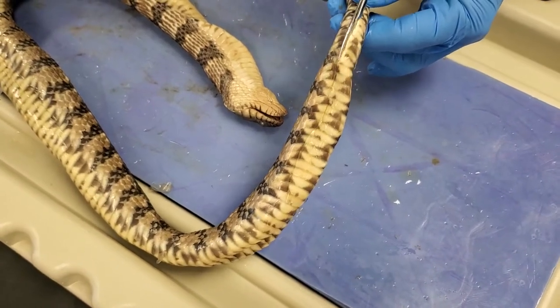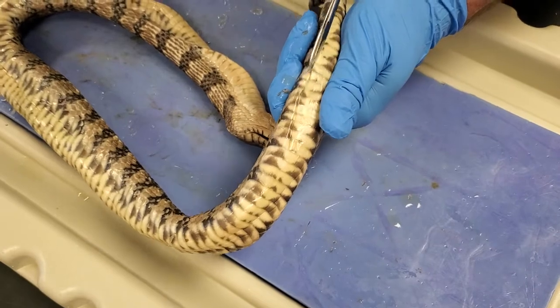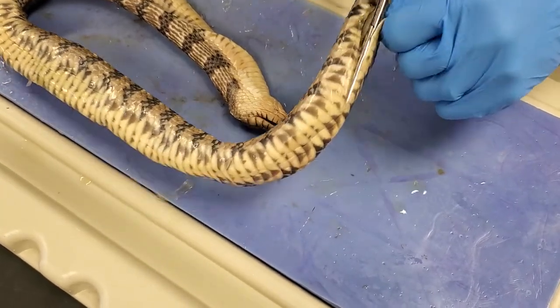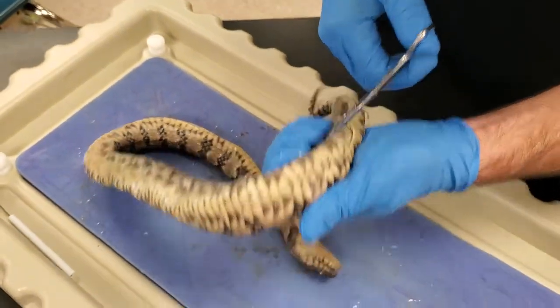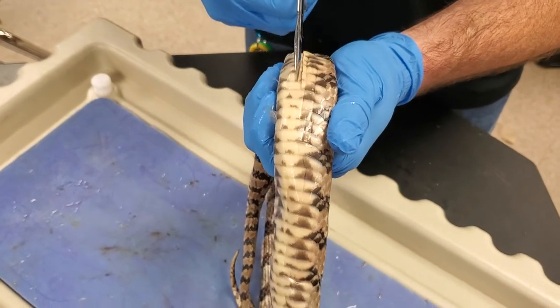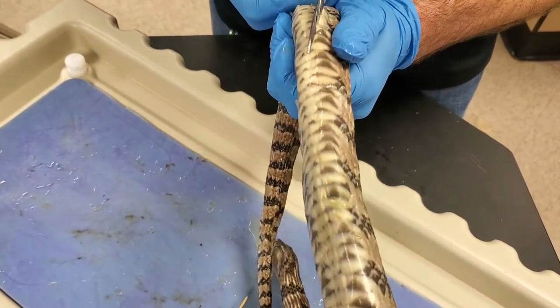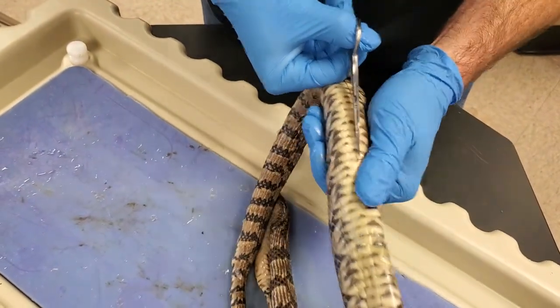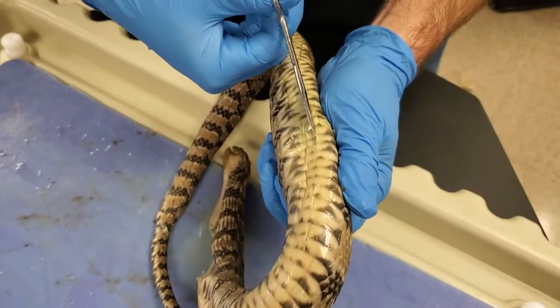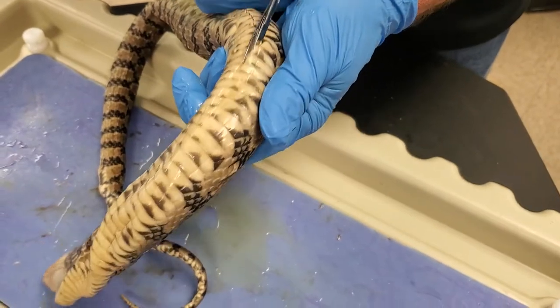So stick that scissor in and we'll start going. Got to be careful — back up every time I hit a little snag, then try again. Probably gonna have some juice coming out of this thing pretty shortly too, trying to stay as shallow as possible. Scissors are the better utensil here rather than a scalpel because these scales are pretty tough, and scalpels cut more deeply as well. These scissors end up being a much better idea for many types of dissections. Kids always want to get their hands on a scalpel, but scissors really do a good job.